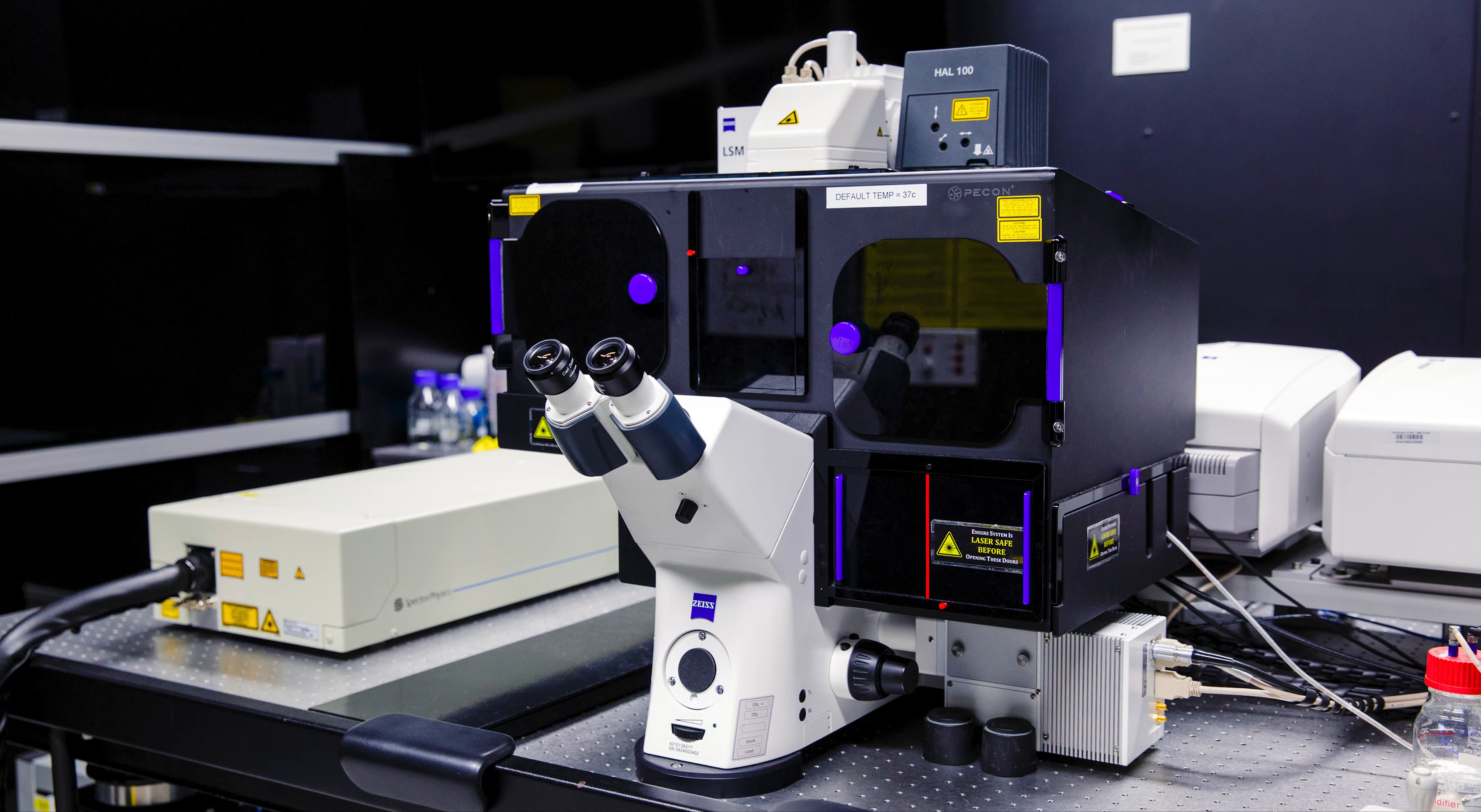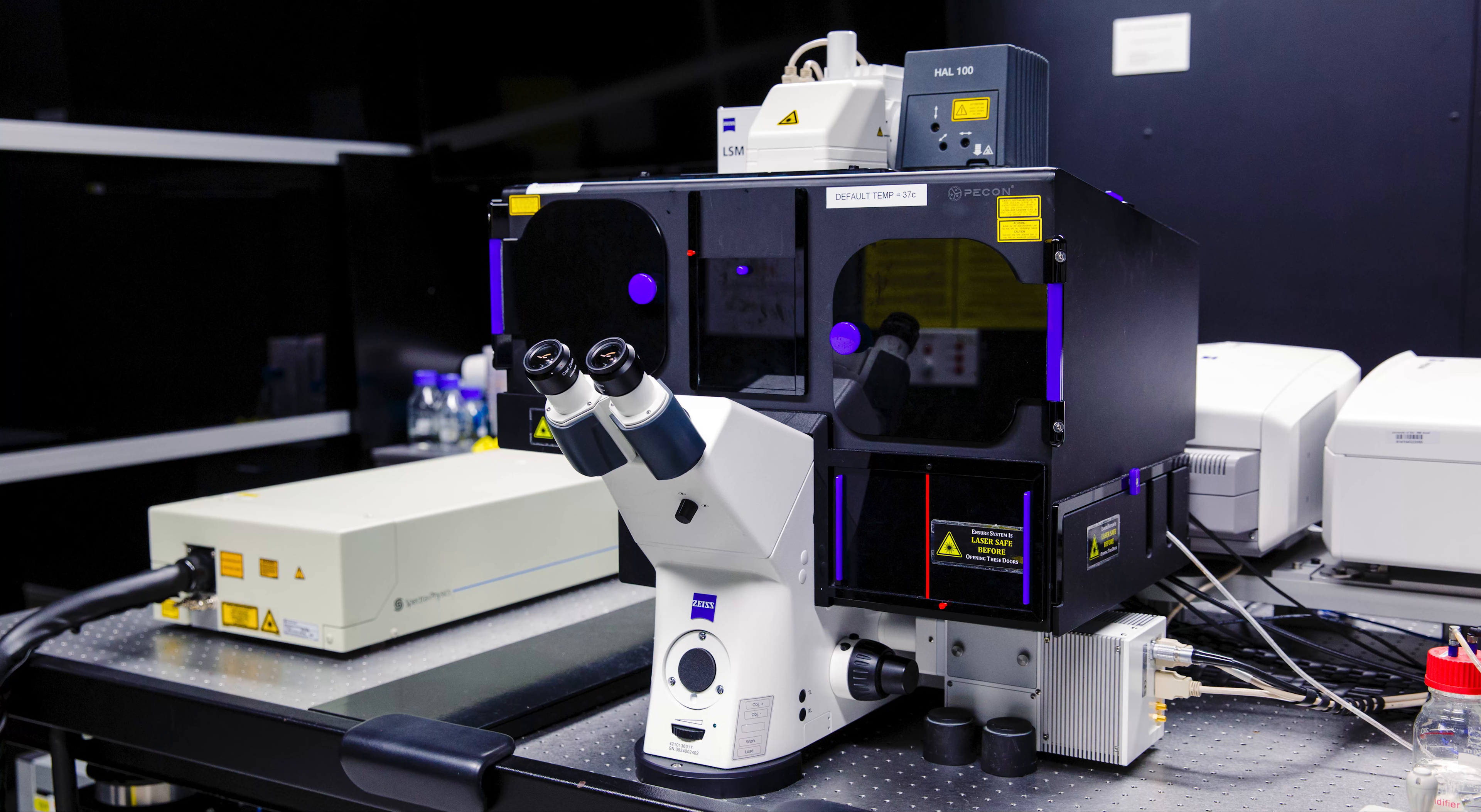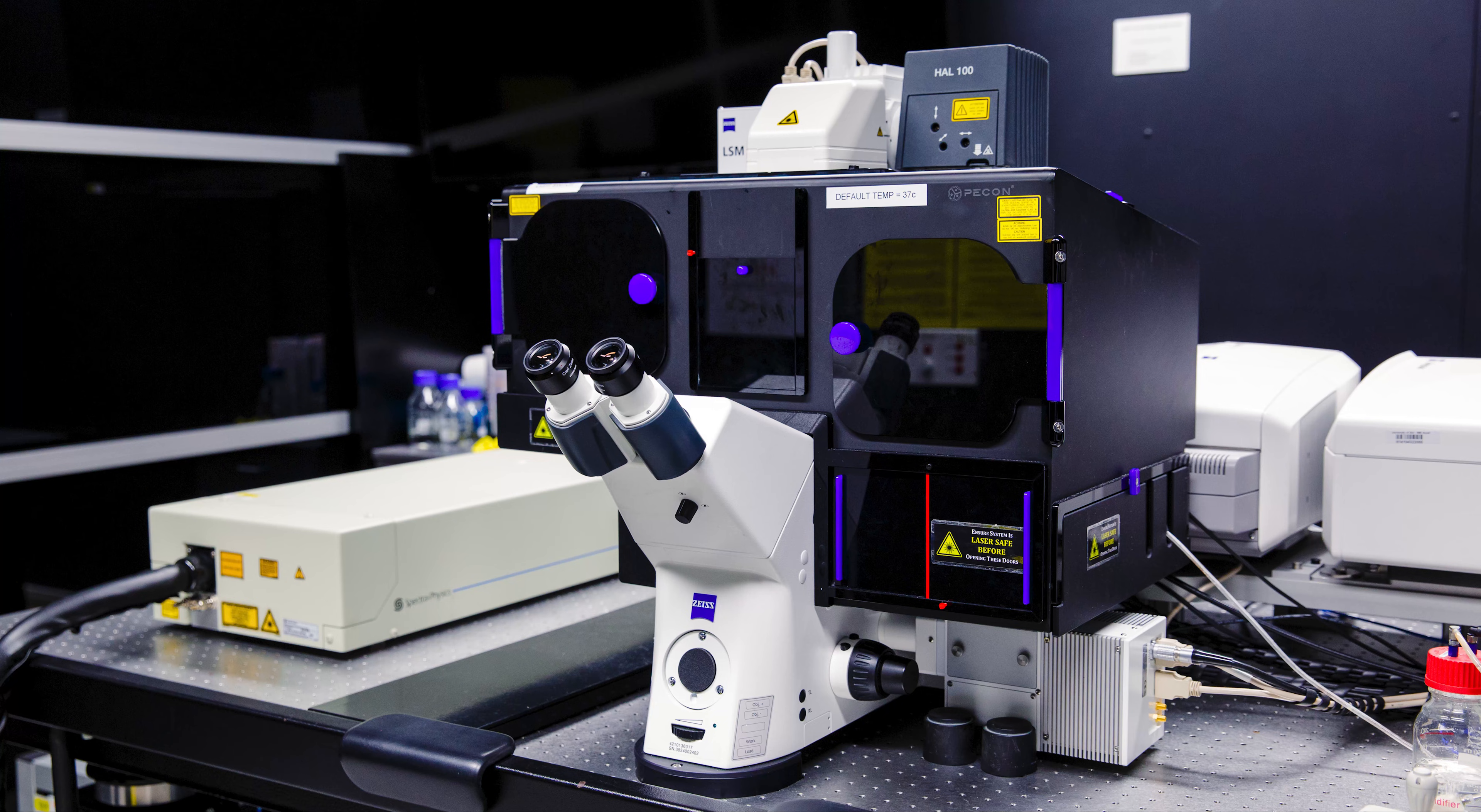This section of the training will cover how to set up the microscope for a 3D Z-Stack acquisition, one of the most common types of images captured on a confocal microscope.